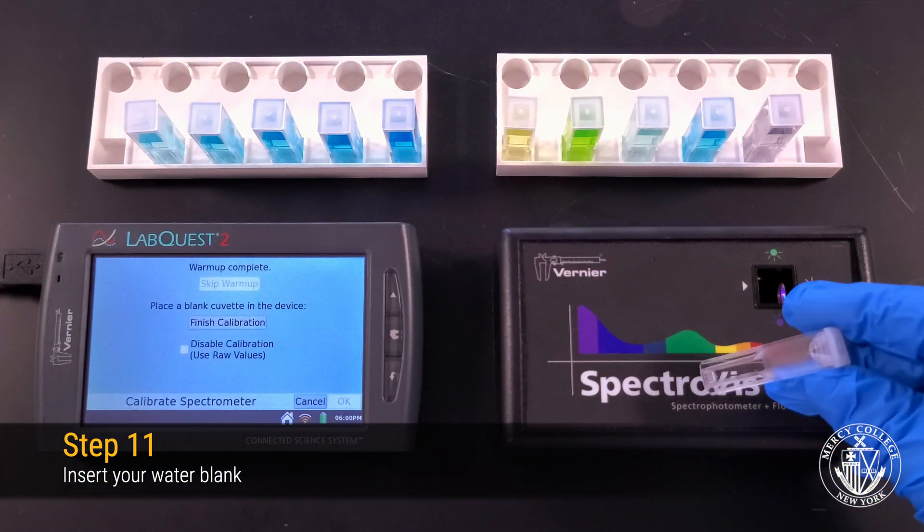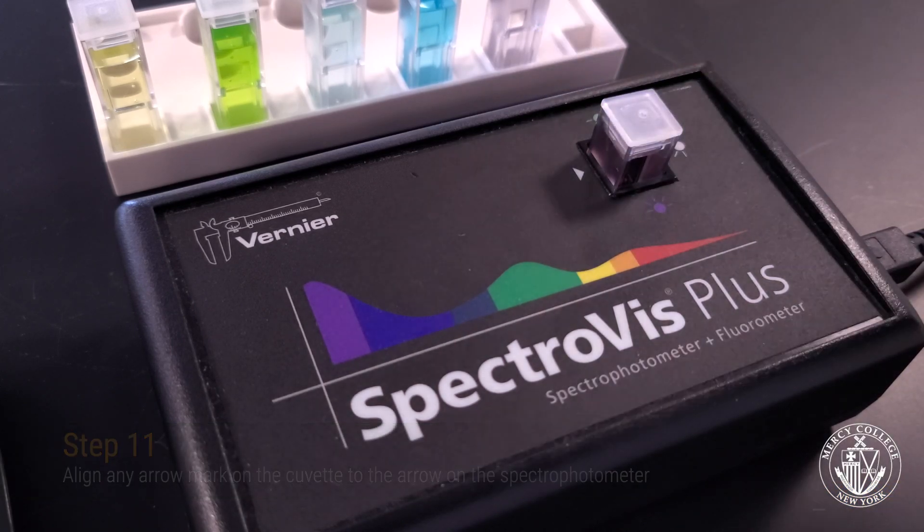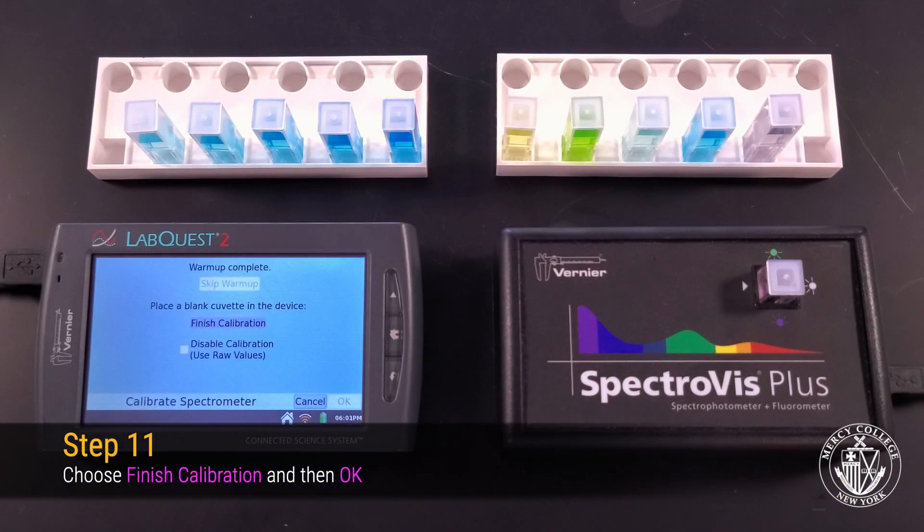As before, make sure that the arrow on the cuvette is lined up with the arrow on the spectrophotometer. Then click Finish Calibration and OK.